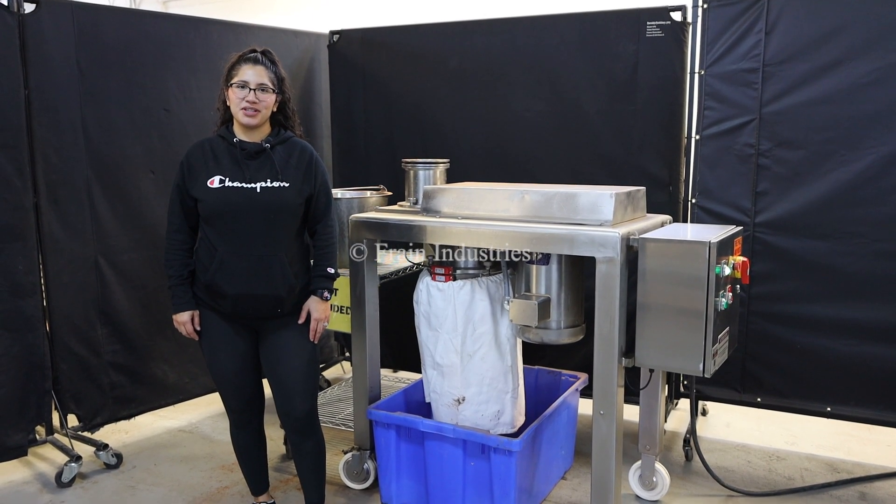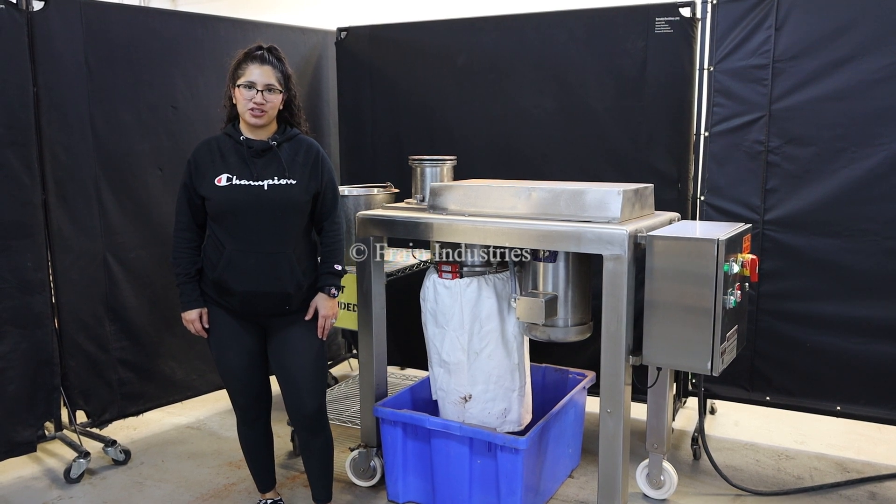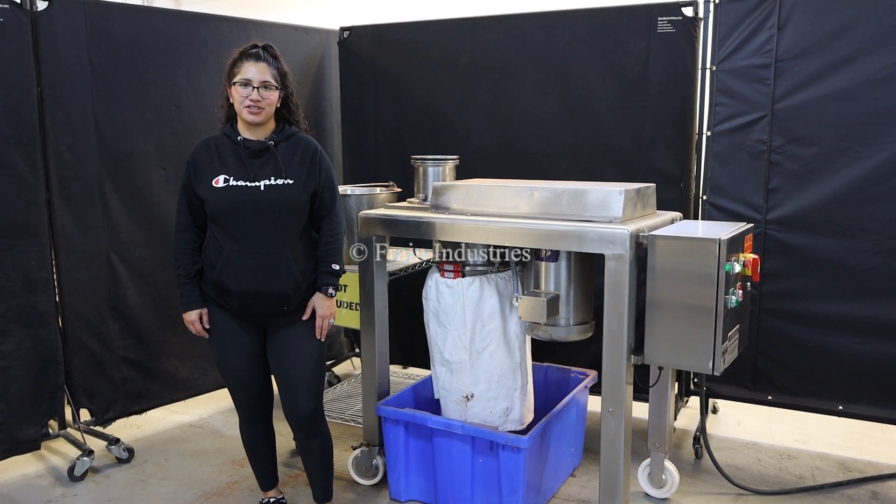Hi, I'm Anna with the Frame Group. Today we'll be cycling your Quadro Mill. This machine is currently set at 480 volts, three phase. We recommend you read the manual in its entirety before powering on this machine.